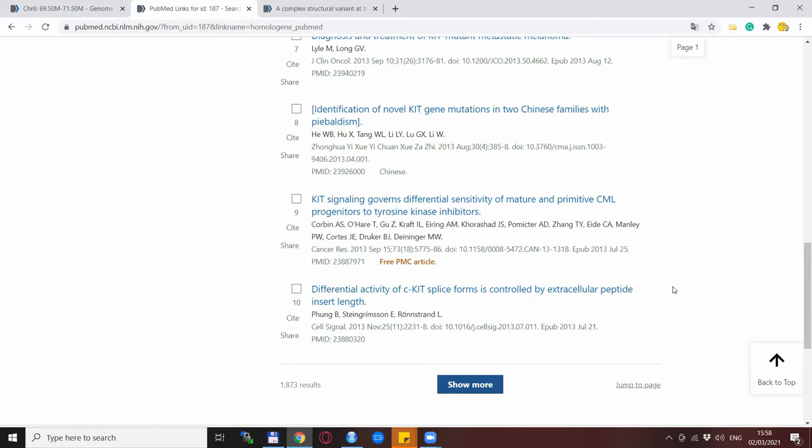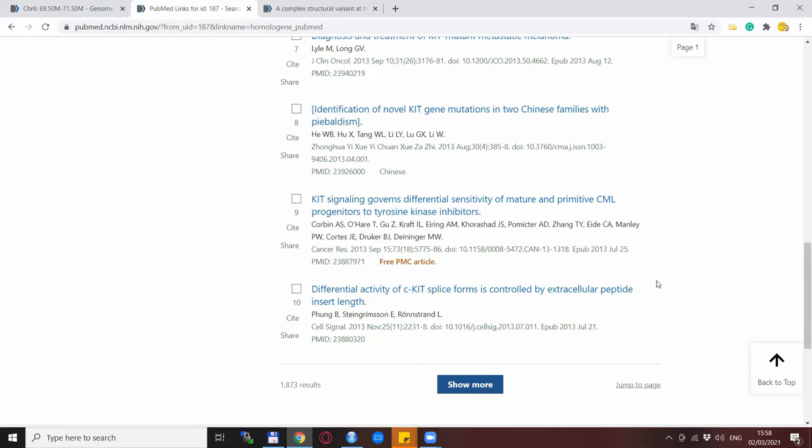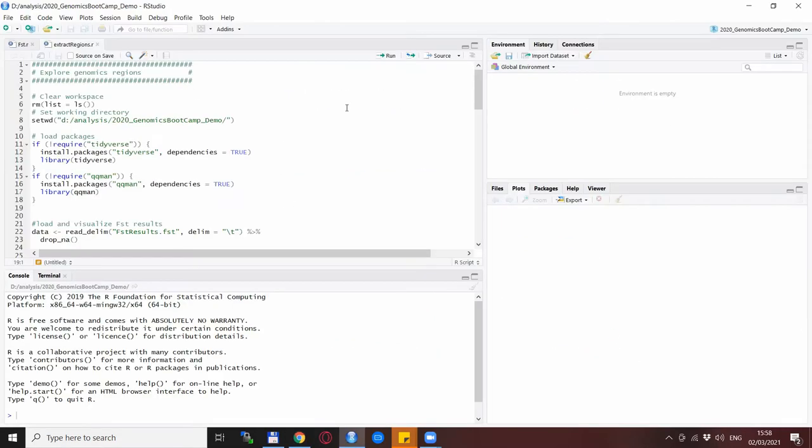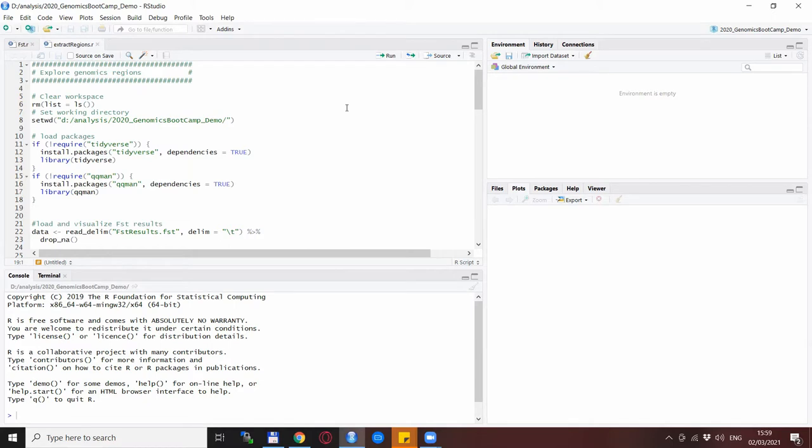Of course not all genes are so well researched so in some cases or for some genes you find much less than this. The one problem with this point and click approach is that if you need to explore 2, 3, 5, 10, 50 regions then it becomes tedious and also it becomes a long process that takes days to complete.